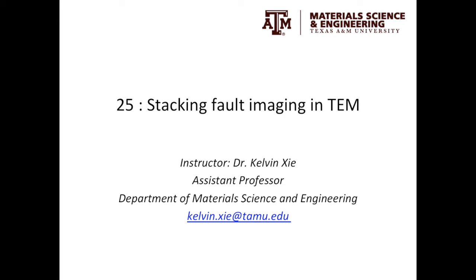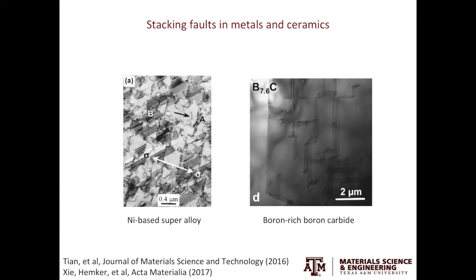Howdy, in this video, we'll discuss stacking fault imaging in TEM. Stacking faults are widely observed in metals with low stacking fault energy and some ceramics. In the examples shown here, you can see bright, dark, bright, dark, bright, dark fringes. These fringes are caused by the stacking faults in the material.